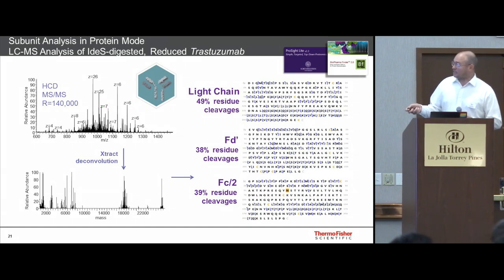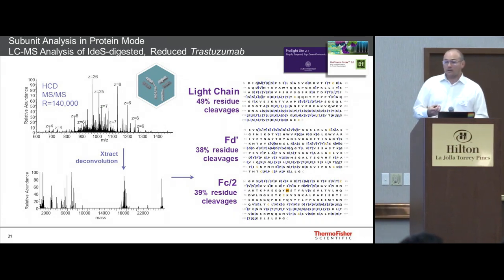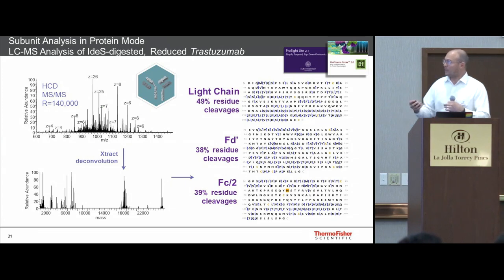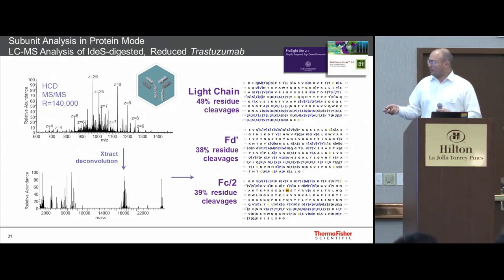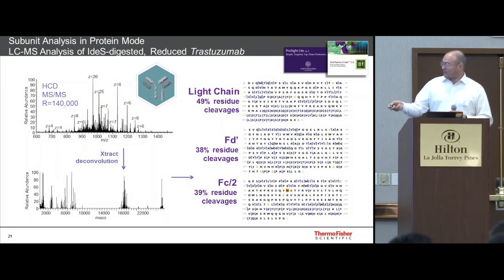We can pick this for HCD fragmentation. So you can do this at 1 fragmentation energy or multiple, and you can put this information together. And then you can generate basically this fragmentation pattern in the MS/MS spectrum. So here we have the m/z domain, the mass spectrum, and then we deconvolute this using Xtract. Again, this is MS/MS information we've deconvolved to get a mass domain fragment pattern.